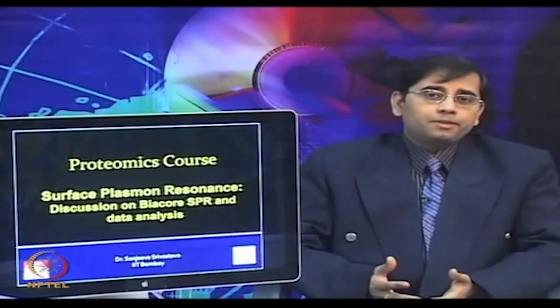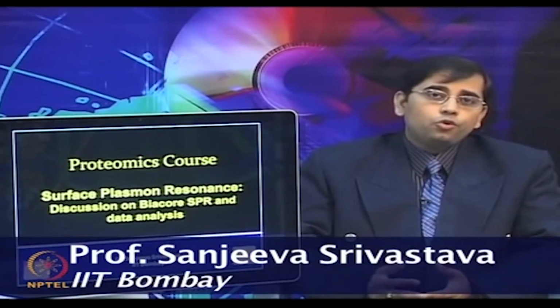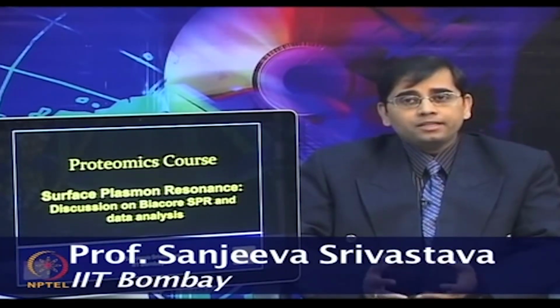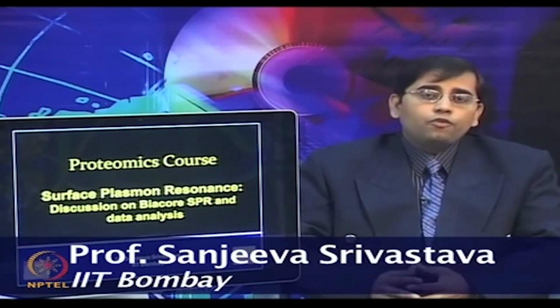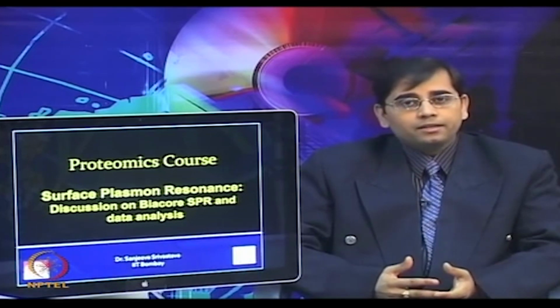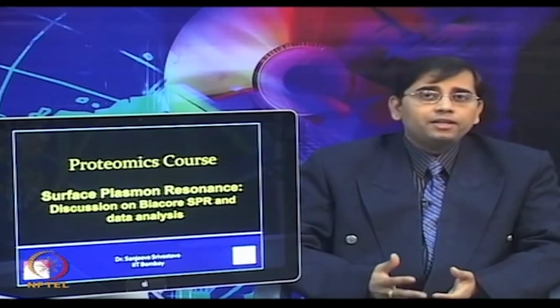Biological systems depend upon the molecular interactions of two or more biomolecules, so that they can form stable complexes. For biomolecular interactions, the principles of thermodynamics, biomolecular structure and recognition play a very crucial role.